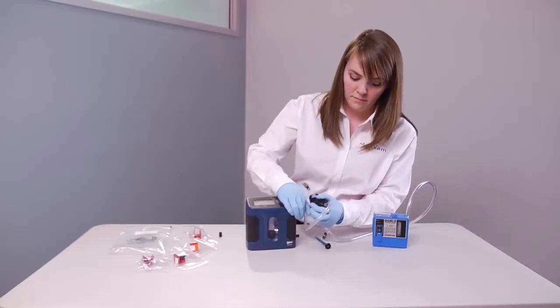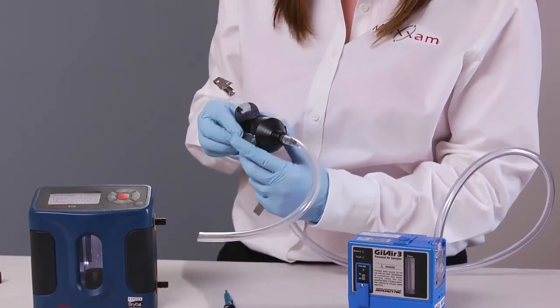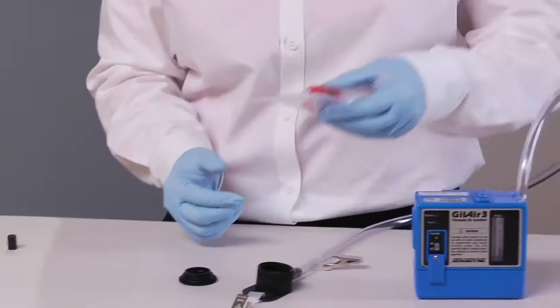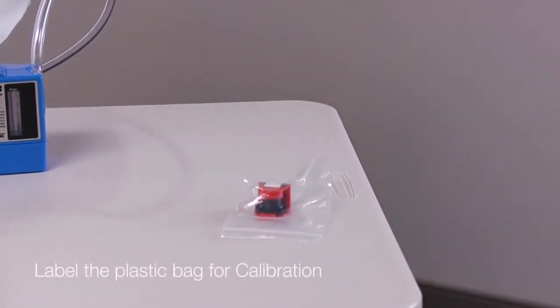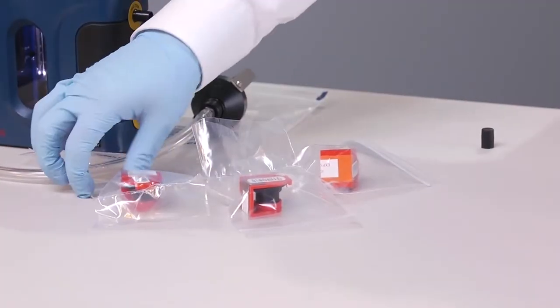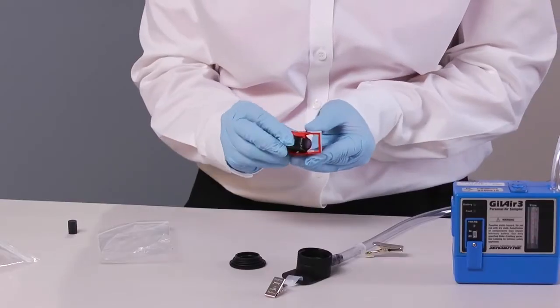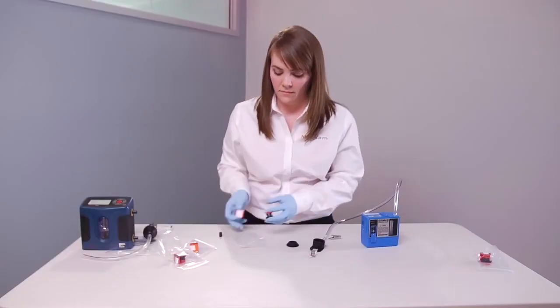Disconnect the IOM cassette and adapter and set it aside for post calibration. It is also good practice to label or mark the bag for the cassette for calibration. Install a new IOM cassette into an IOM sampler body and you can collect an air sample.